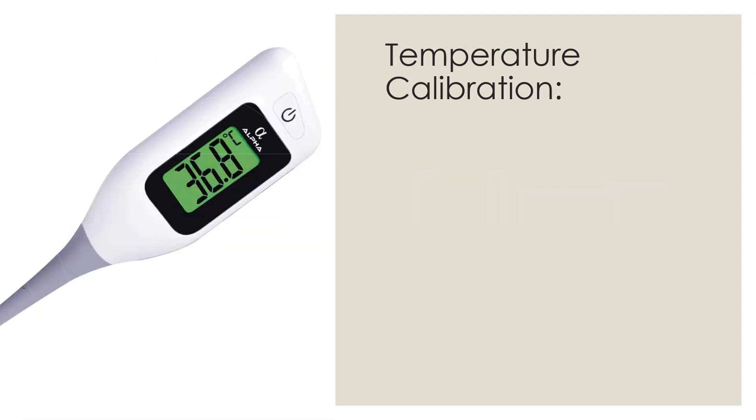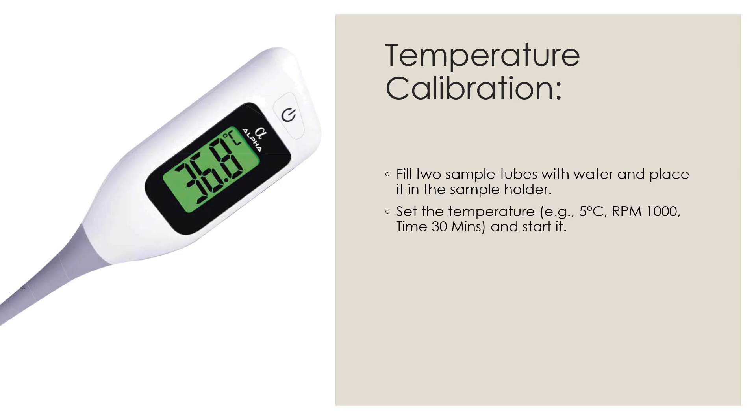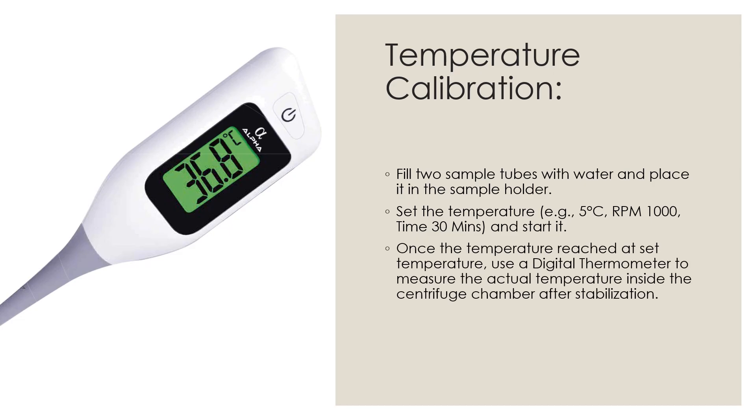Next is temperature calibration. Fill two sample tubes with water or any other suitable solvent and place them in the sample holder. Set the temperature — for example 5 degrees C — with RPM 1000 and time 30 minutes, and start the centrifuge. You can set the temperature as per the different types of centrifuge. Once the temperature reaches the set point, use a digital thermometer to measure the actual temperature inside the centrifuge chamber after stabilization.